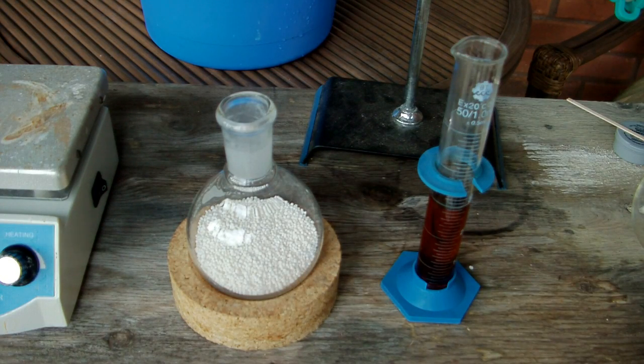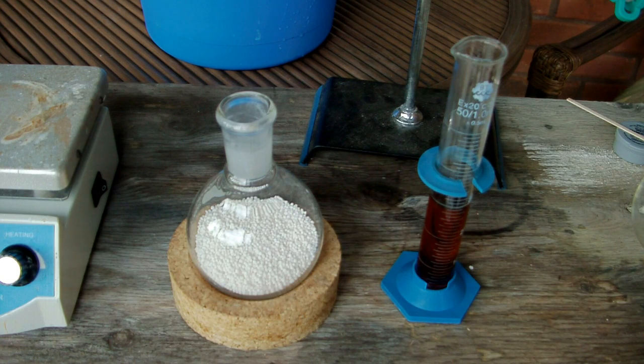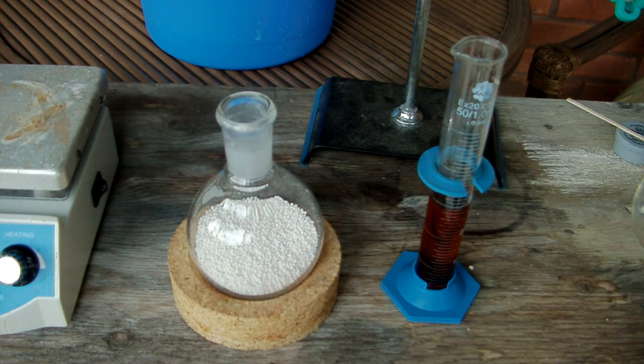Hey everyone, in today's video we're going to be making nitric acid using the distillation method. This requires that you get any nitrate salt and concentrated sulfuric acid. When you combine these two, you make nitric acid and the corresponding sulfate salt.